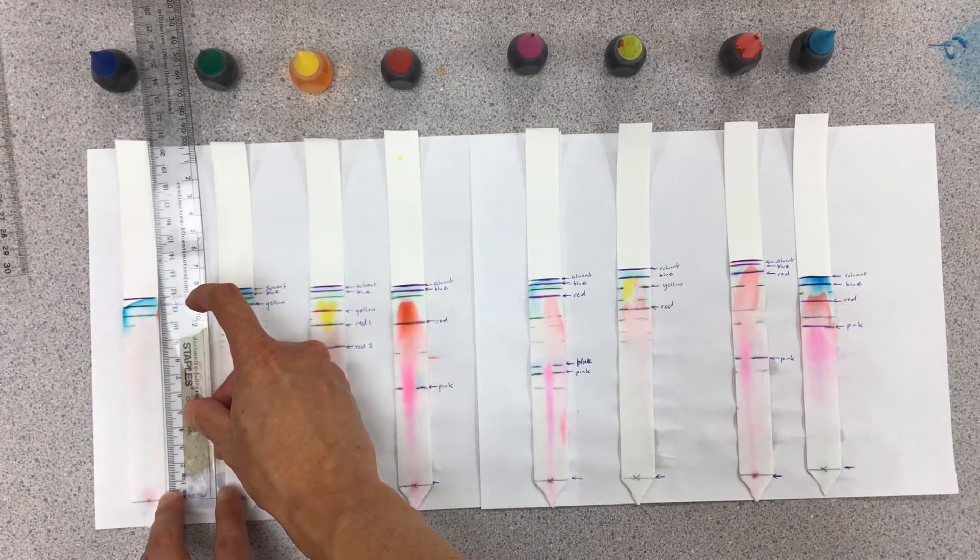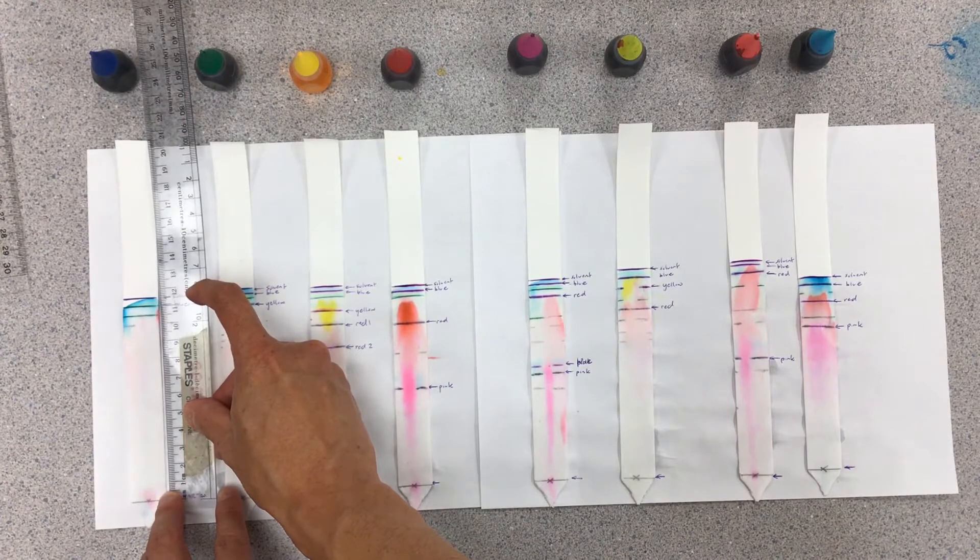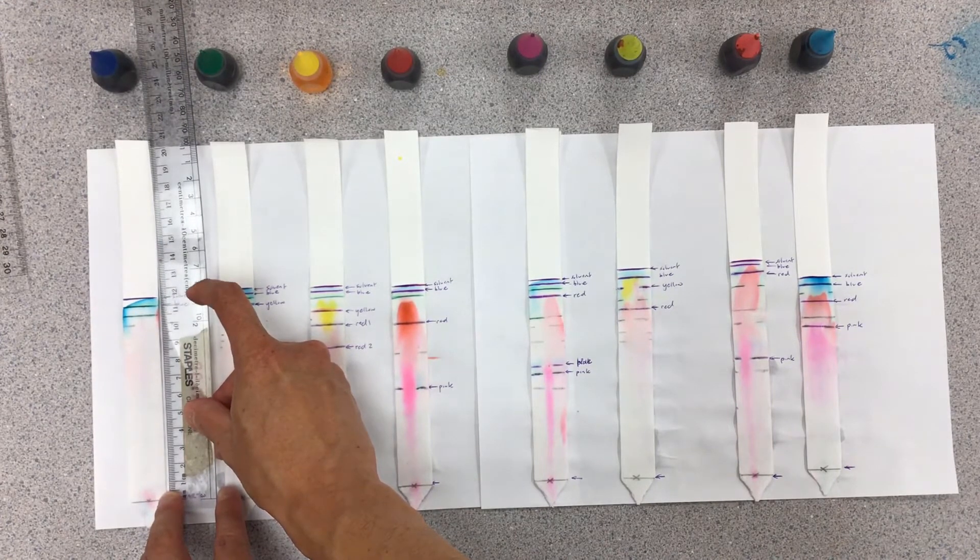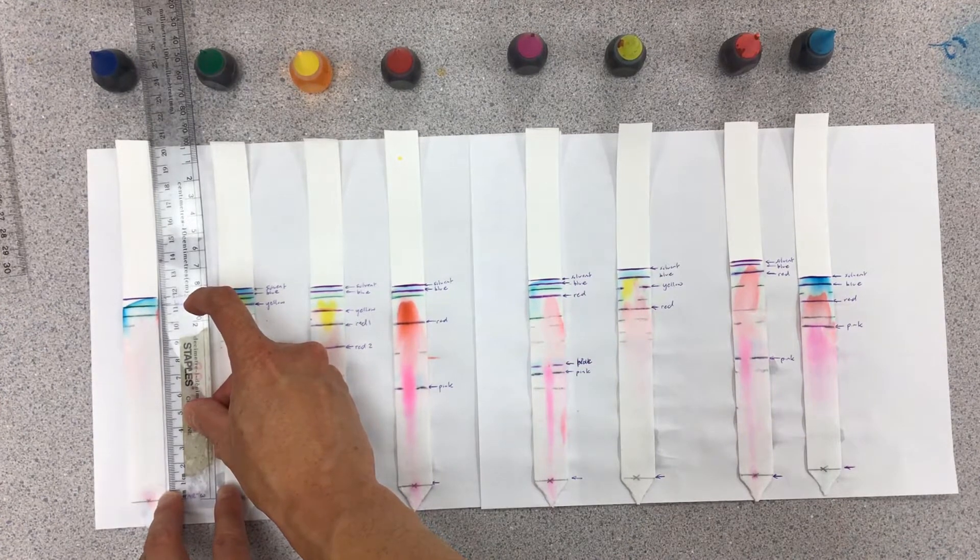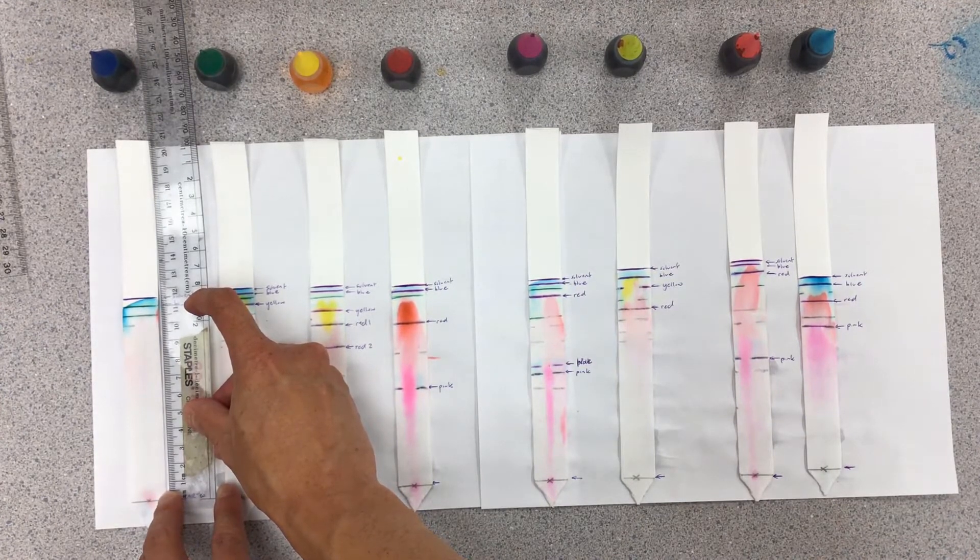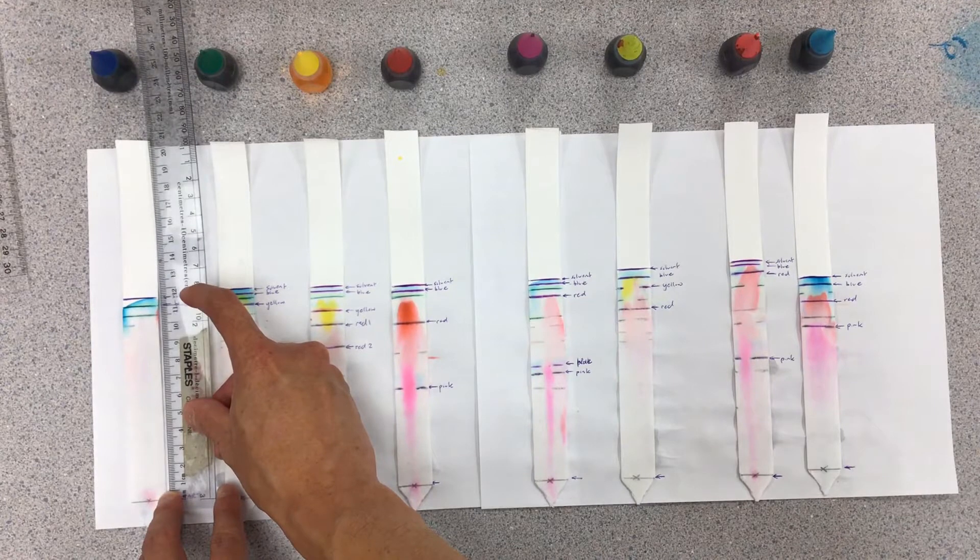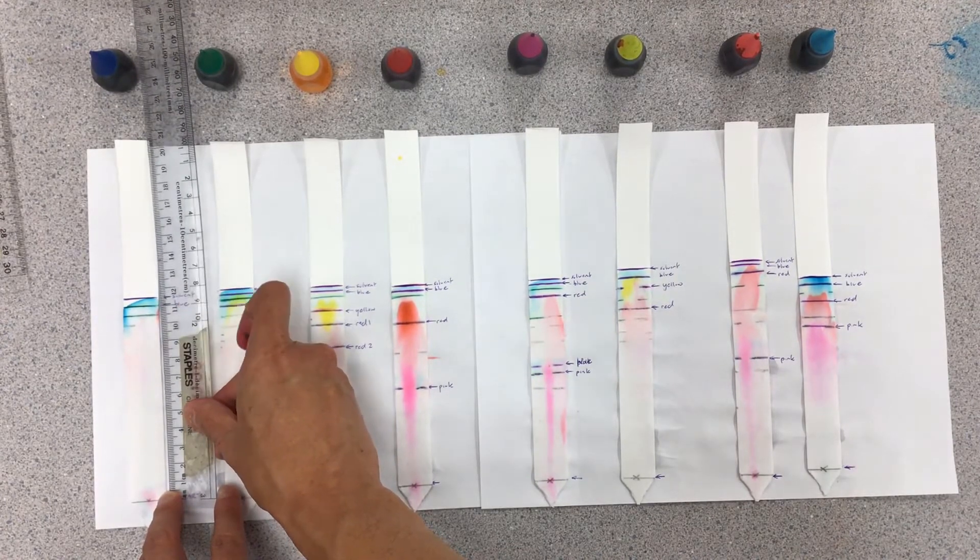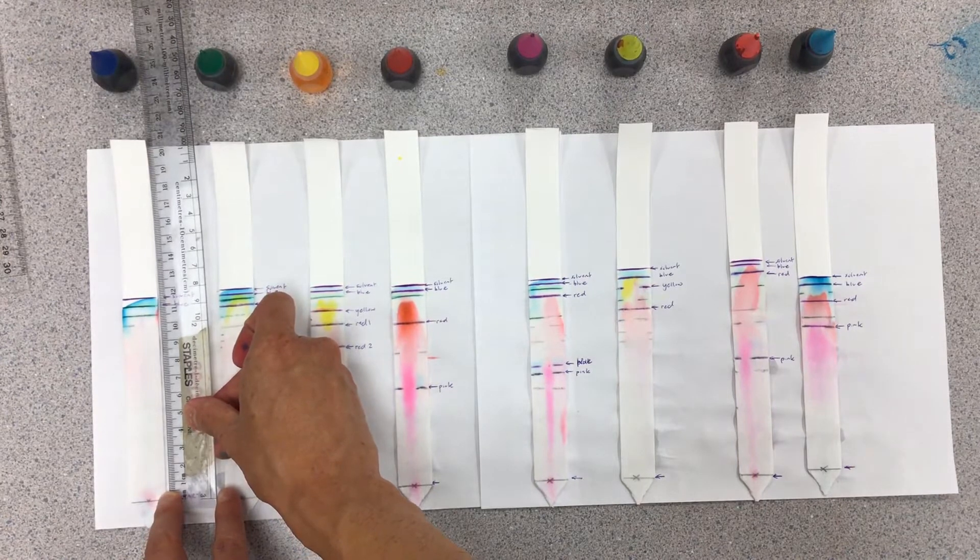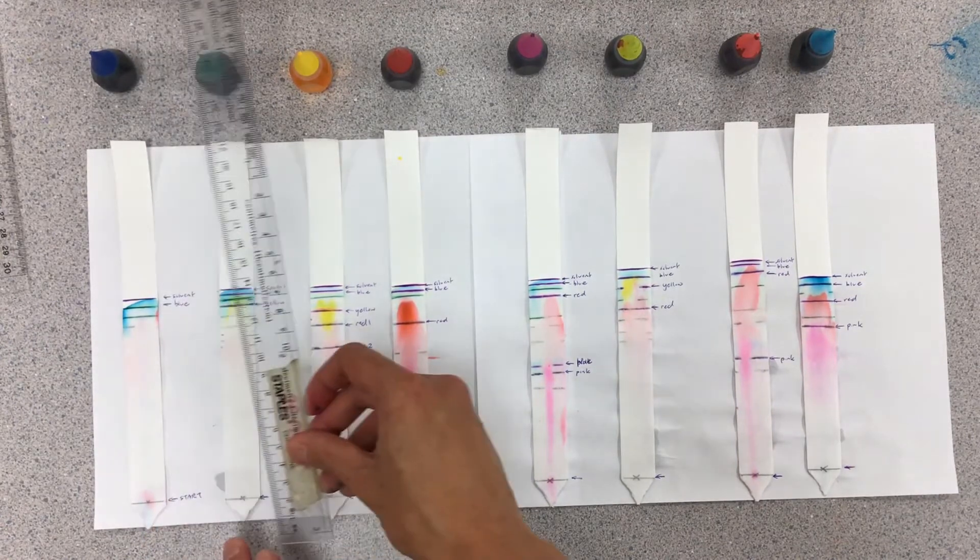For example, our blue here would be 11 centimeters divided by 11.5. That's going to give you a ratio called an RF value, a ratio of fronts. That is an intensive value, so you can actually compare the RF value to a known table and see if you can identify which dye this is.